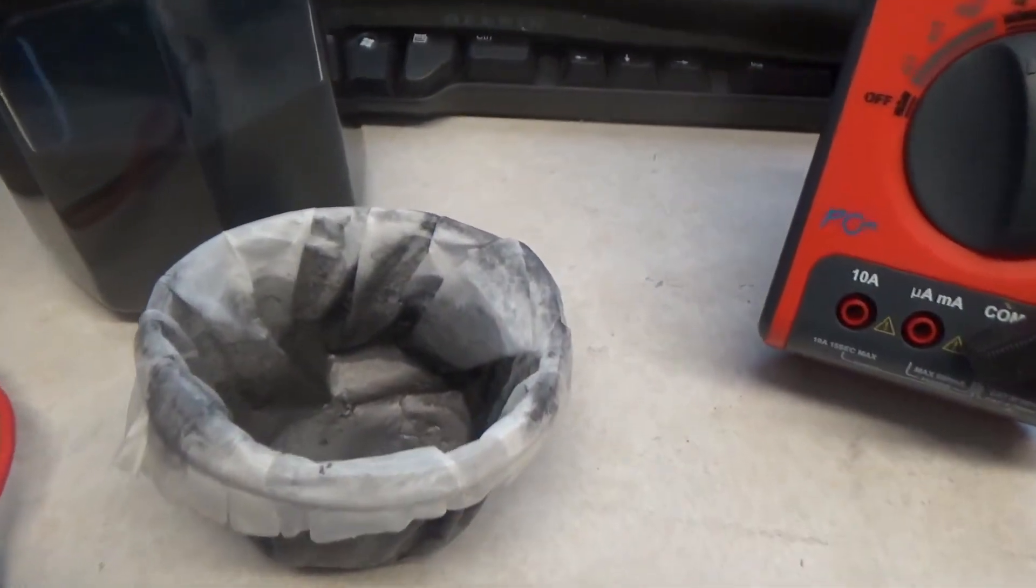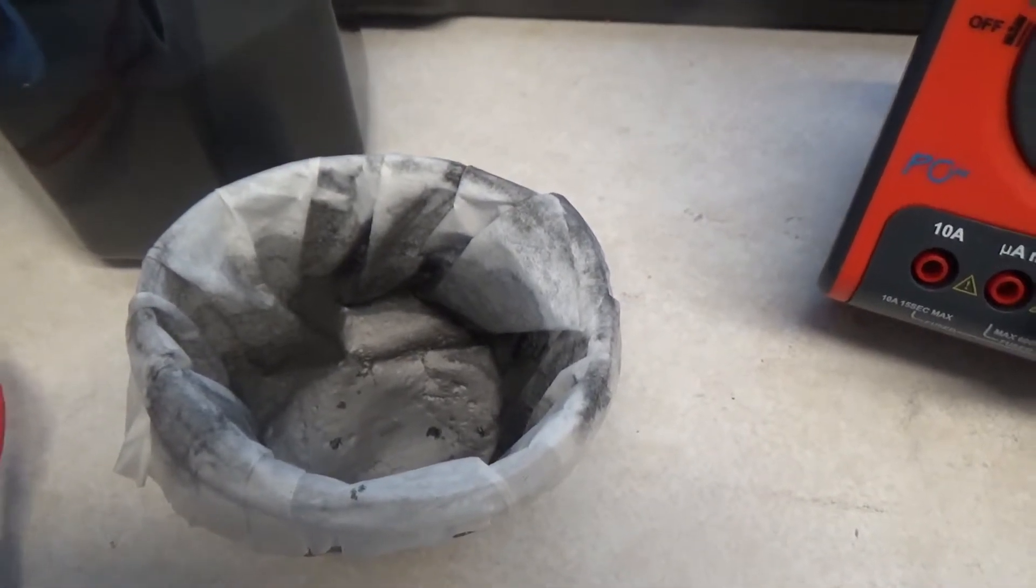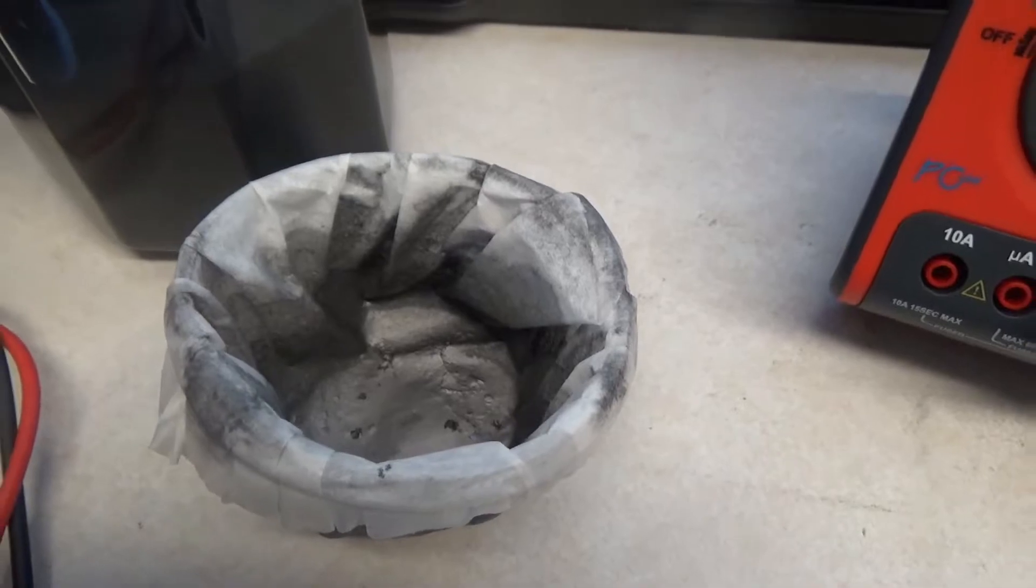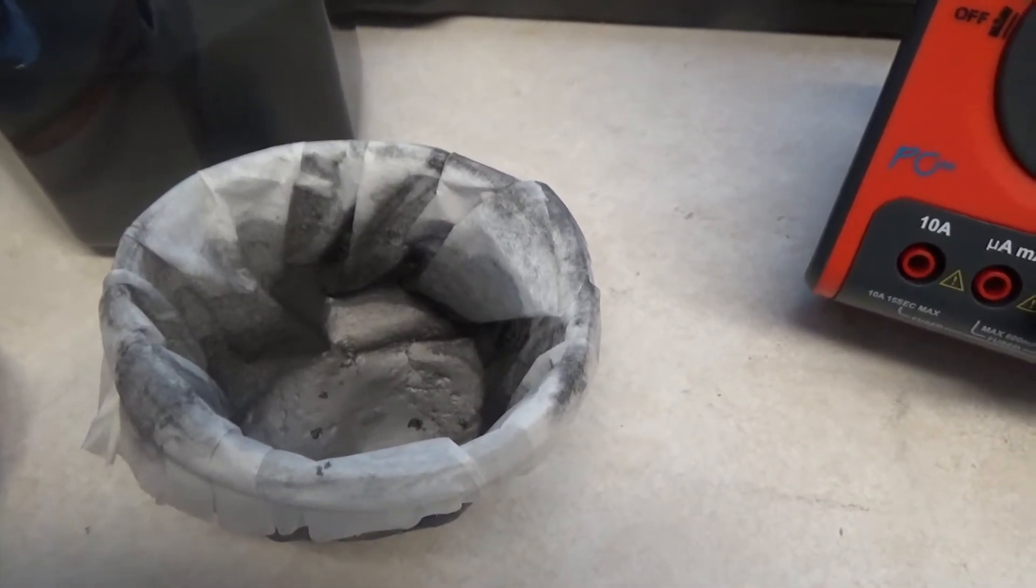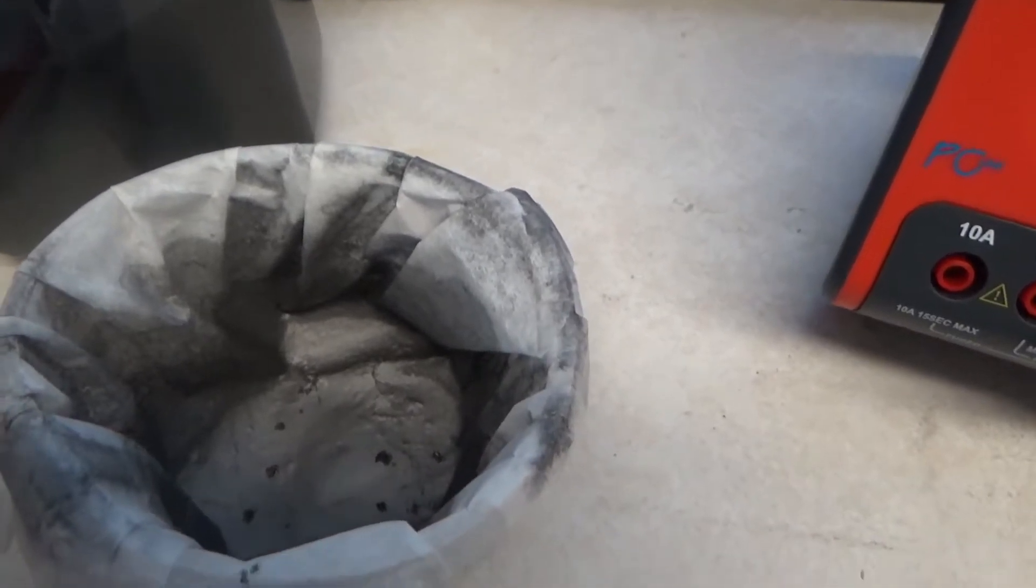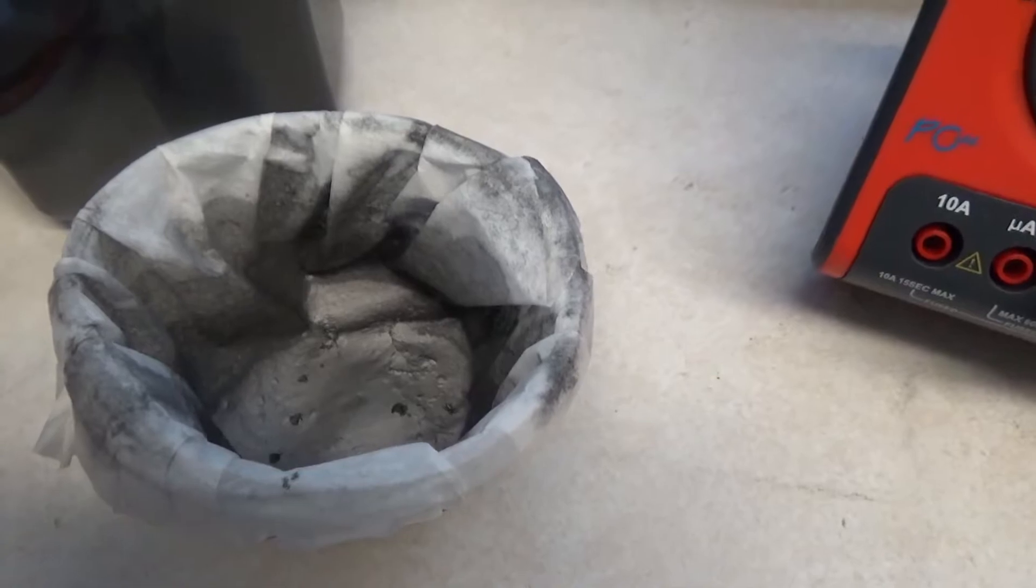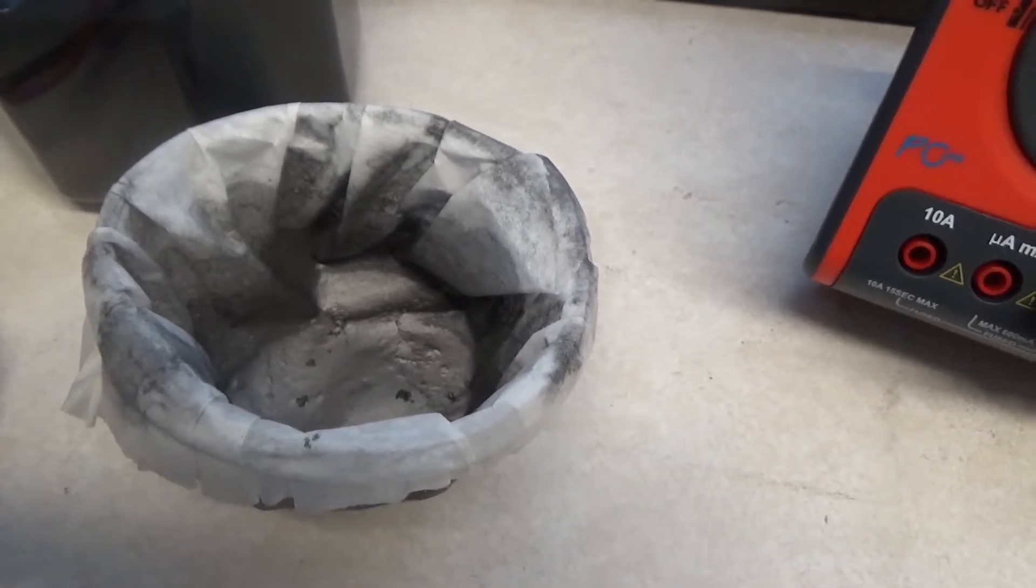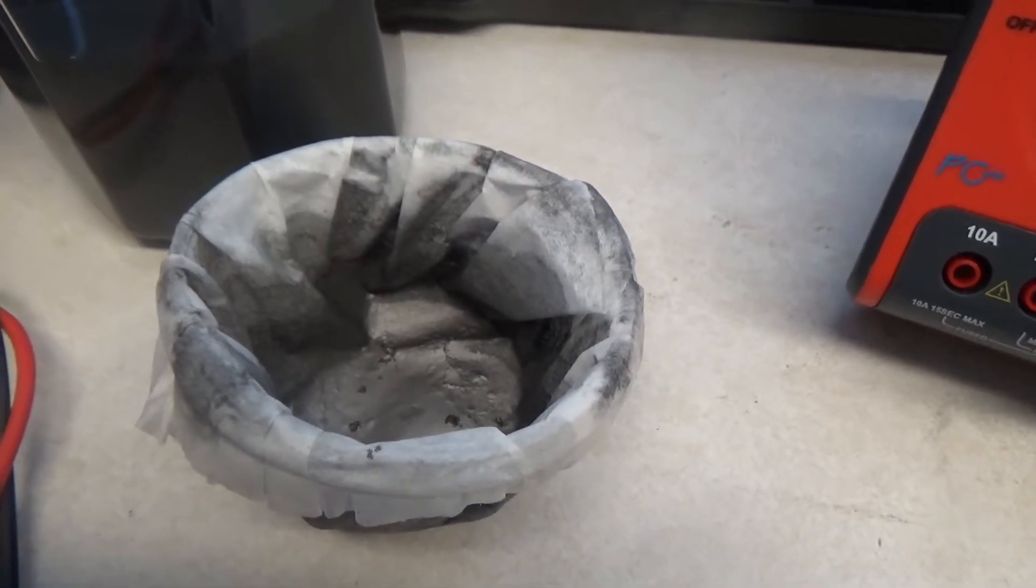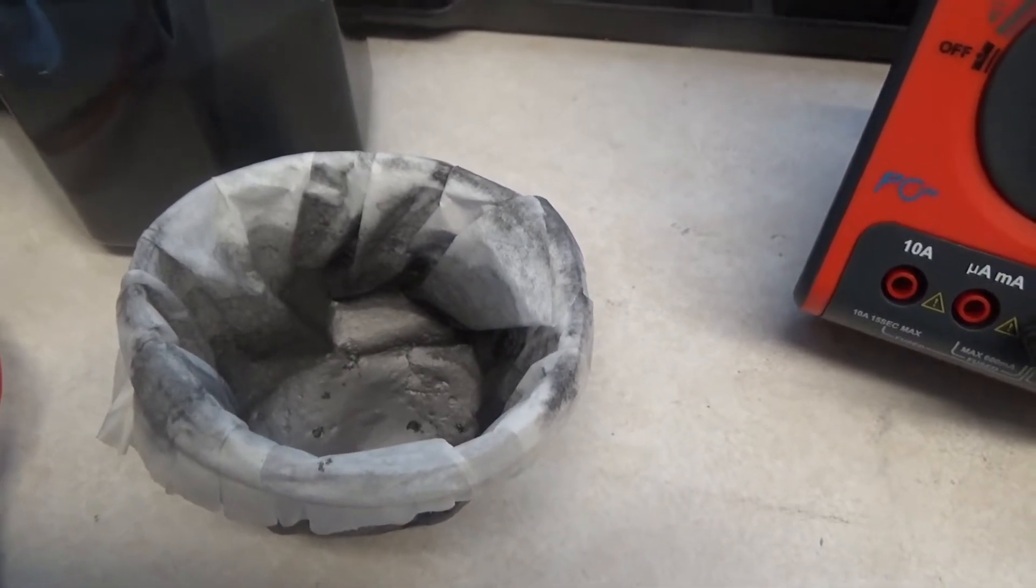So it does look like I have graphene. I don't have the funds to do a full test to confirm this. I'm going to have to go on faith, but this is using the Robert Murray Smith method, and he's darned excellent. So I'm expecting that it really is working, and I'm getting it. So it looks like my do-it-yourself sonicator combined with the flake graphite and the acetone-water mixture is working to actually produce graphene, which is really exciting.